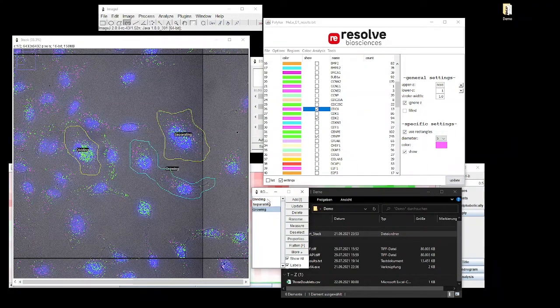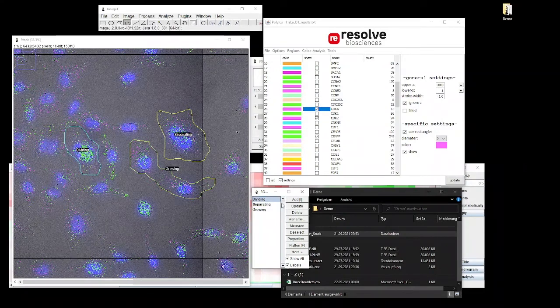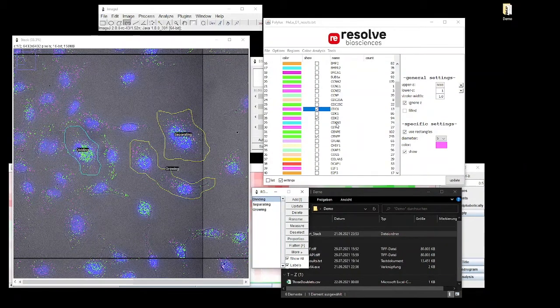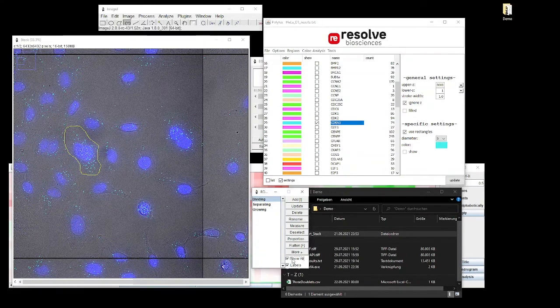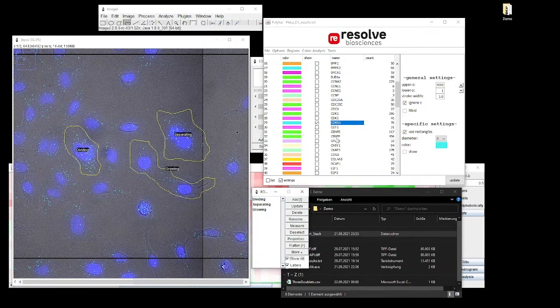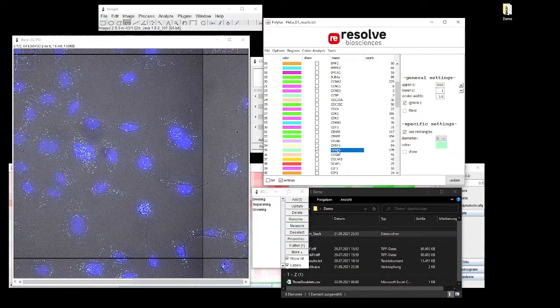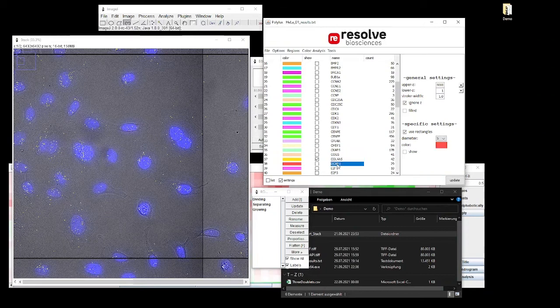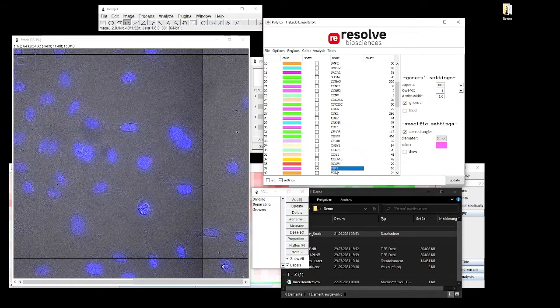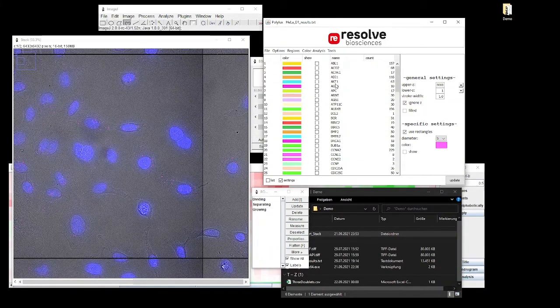The same export will be done if a proper cell segmentation is done with hundreds of thousands of cells. One can also double click transcripts to just highlight one type and change quickly from one to the other.